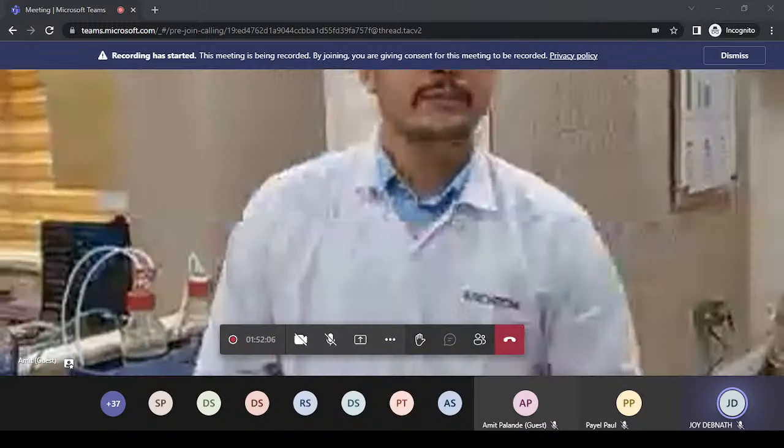So mostly in column chromatography, we change the gradient program as per RT value. But here we can change the gradient program as per distance traveled by solvent. It will be polar to non-polar. We can separate all the applied components at the application position at different RF values by setting up a proper gradient. I hope you have seen that application, separation of different lipids by using AMD2. So this was about the automated multiple development module in the CAMAG HPTLC system.